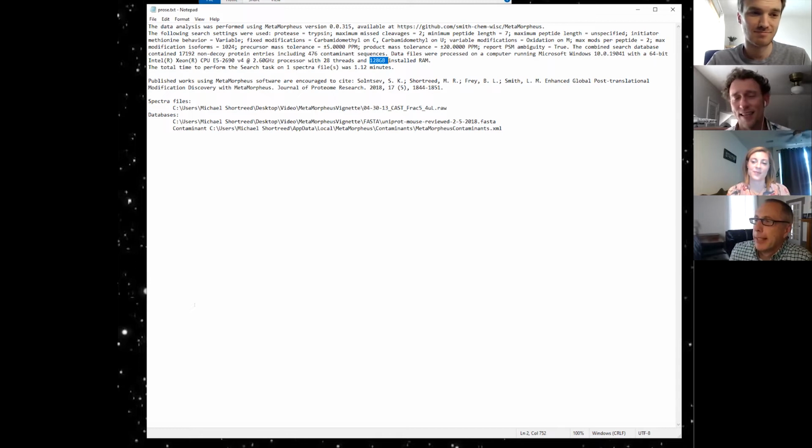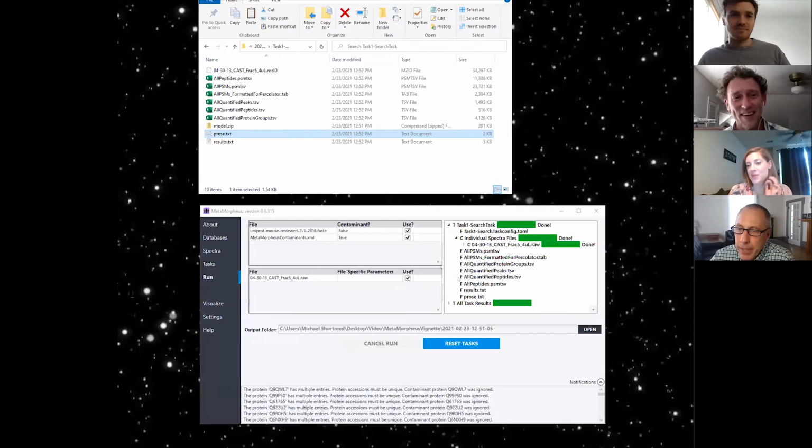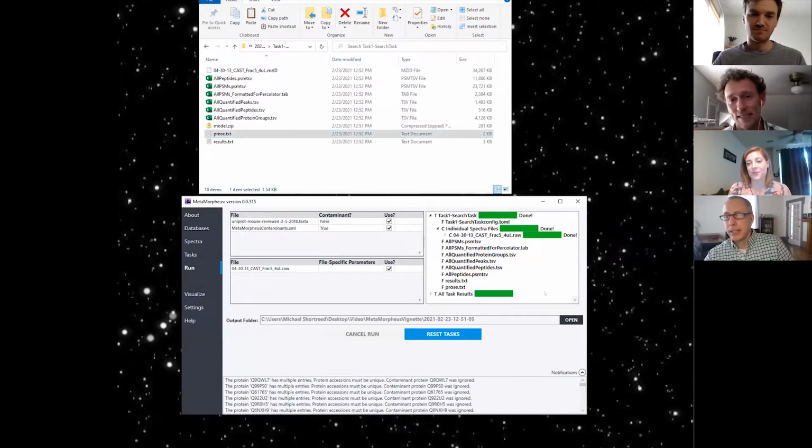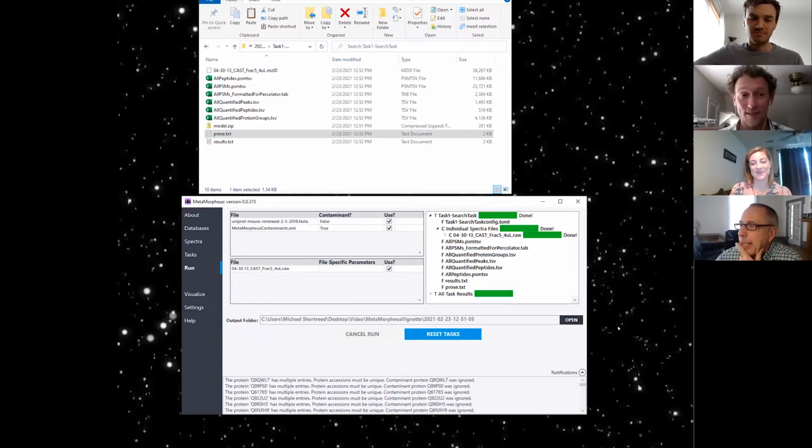I just had to say that because, not that I think it's unreasonable, but that was really fast. I just had to ask what we are doing here. Search is also the fastest task. Calibration and GPTMD take a little more time. Got it. For my laptop, this would take about 5 minutes. That's still really fast. It's no slouch. But okay, cool. Those files Rachel's going to talk about. I'm excited about that.